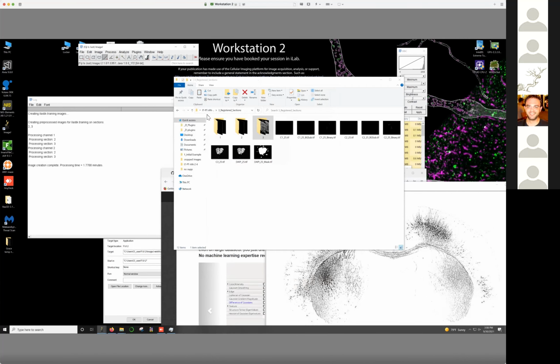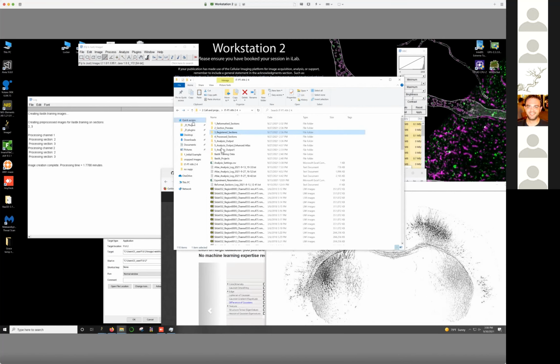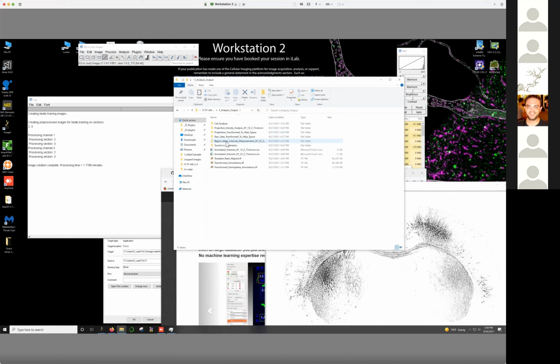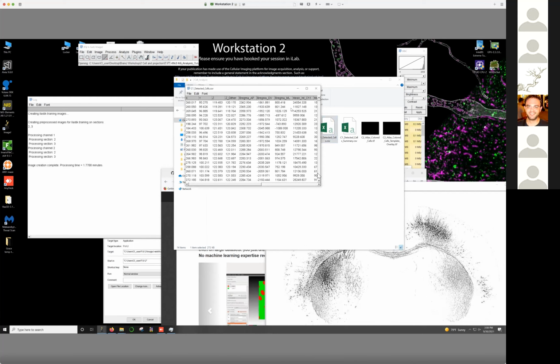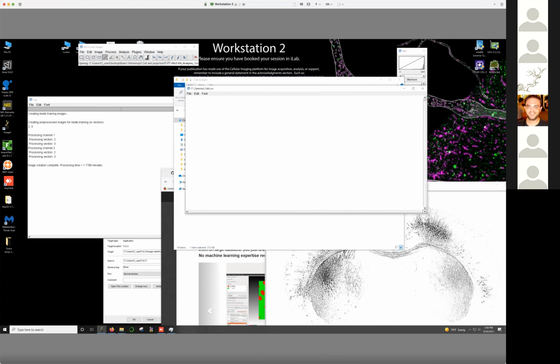So that's the first thing that I would check. If that's good, then you can trust the alignment has worked, so the cell locations and things like that should be good. And so for cells, you get a bunch of outputs. Obviously, if you're just interested in plotting the data, you'll have a CSV file here that has every single cell and its location.